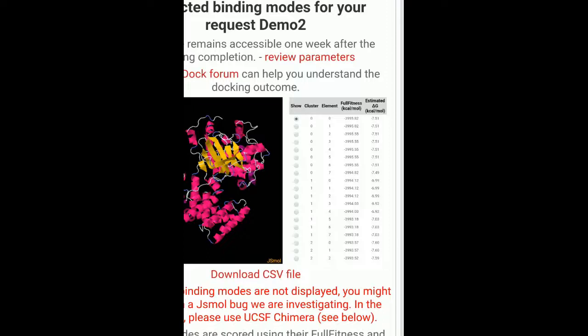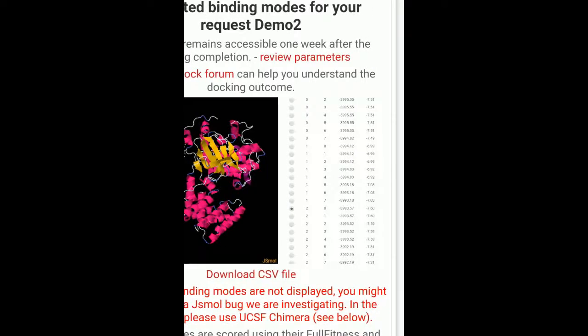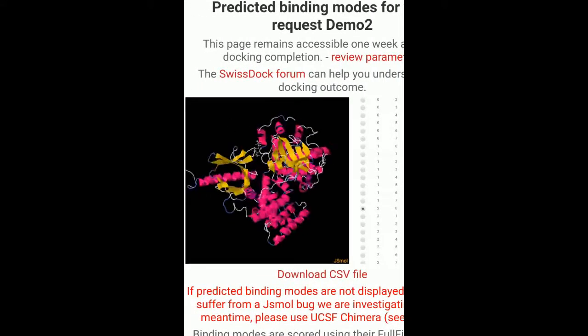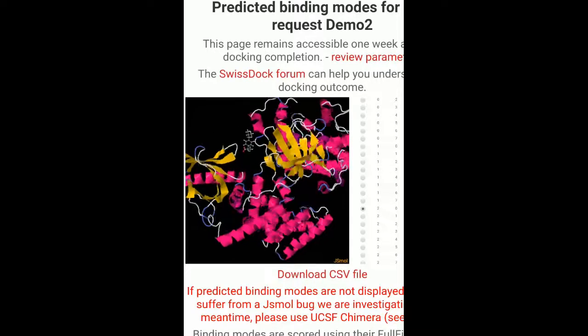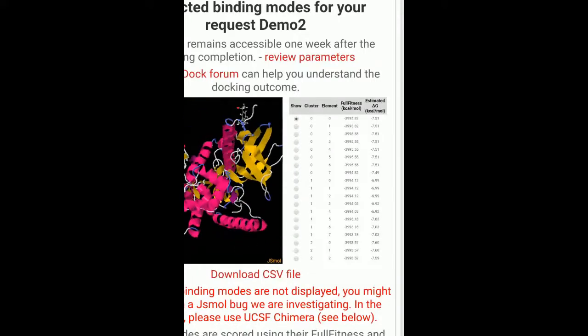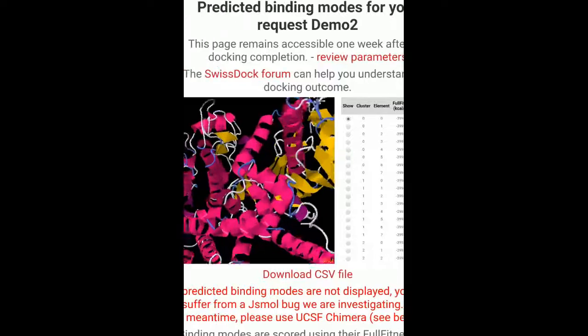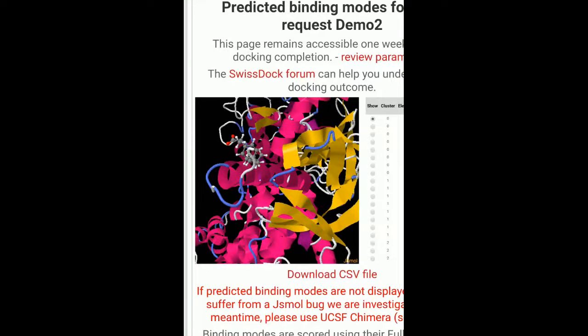So if I want to check for 7.60 — you can see this is where it's generated. I think the ligand here in 7.60 is fitted better, as compared to your first one, that is 7.51. For 7.51, this was where the ligand was — it was towards the edge somewhere here.